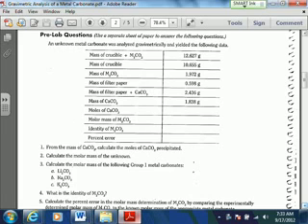Then we take the mass of the filter paper, and then we're basically doing the chemical reaction where we dump the calcium chloride and the metal carbonate together, and then we figure out how much CaCO3 we get out, and it ends up being about 1.838 grams, okay? So then they want us to find the moles of CaCO3. I think you guys are fine on that. You just use the molar mass of the calcium carbonate there.